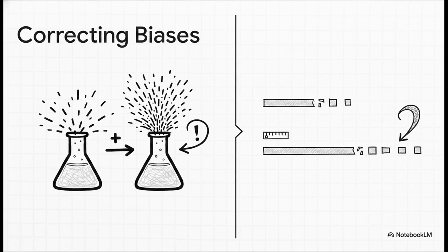Bias number 2, transcript length. Think back to library prep when we fragmented our molecules into 300 to 500 base pair chunks. A massive, long transcript is going to break into way more fragments than a short one, which artificially inflates its read count. We absolutely have to mathematically correct for both of these issues.